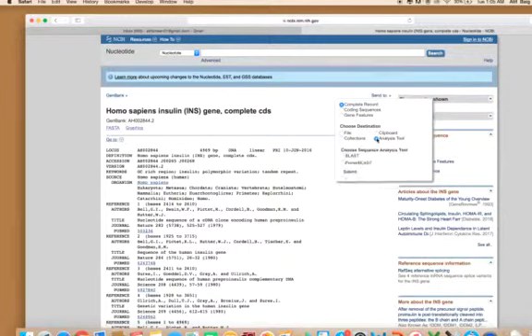Then the third option is the analysis tool. You can go directly for BLAST and Primer-BLAST, and you can have all the analysis and the results available directly, rather than copy-pasting all this sequence into a new BLAST window. And number four is collections. In the collections you can just save it for future use or for your future record. It will become like your library. Our aim is to download the sequence.